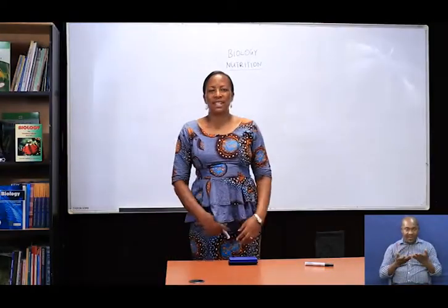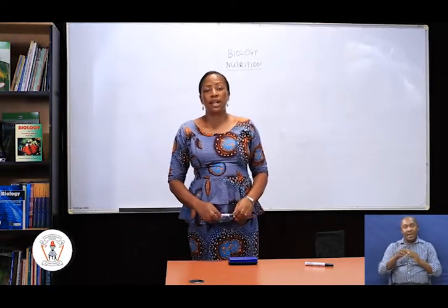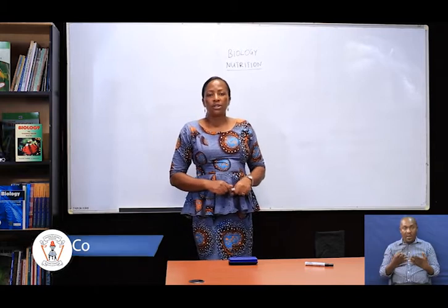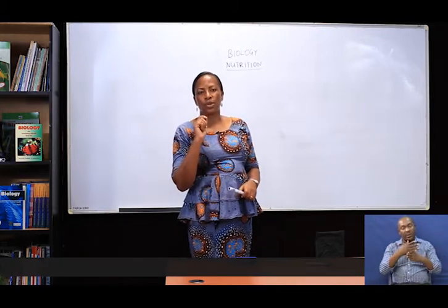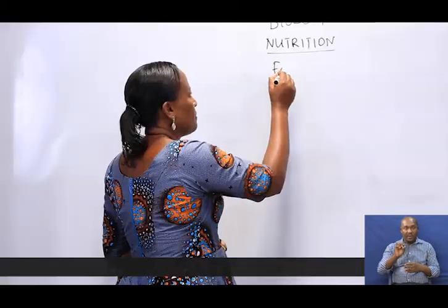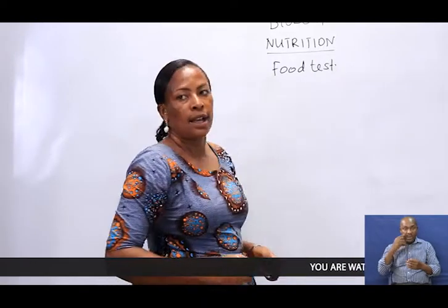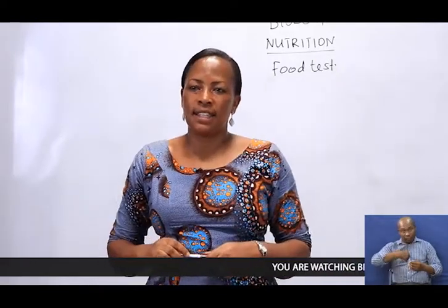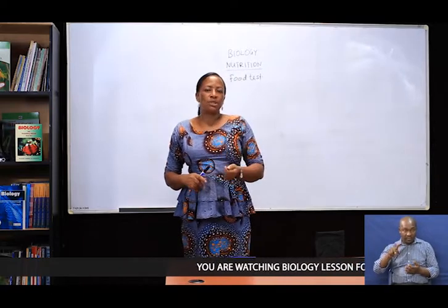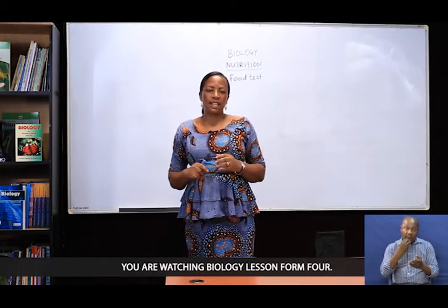Welcome, my lovely students, to our subject biology, and today's topic is nutrition. We are going to learn nutrition under a subtopic called the food test. Food test. This is the practical experiment which aims to detect the food contents in a given food sample.